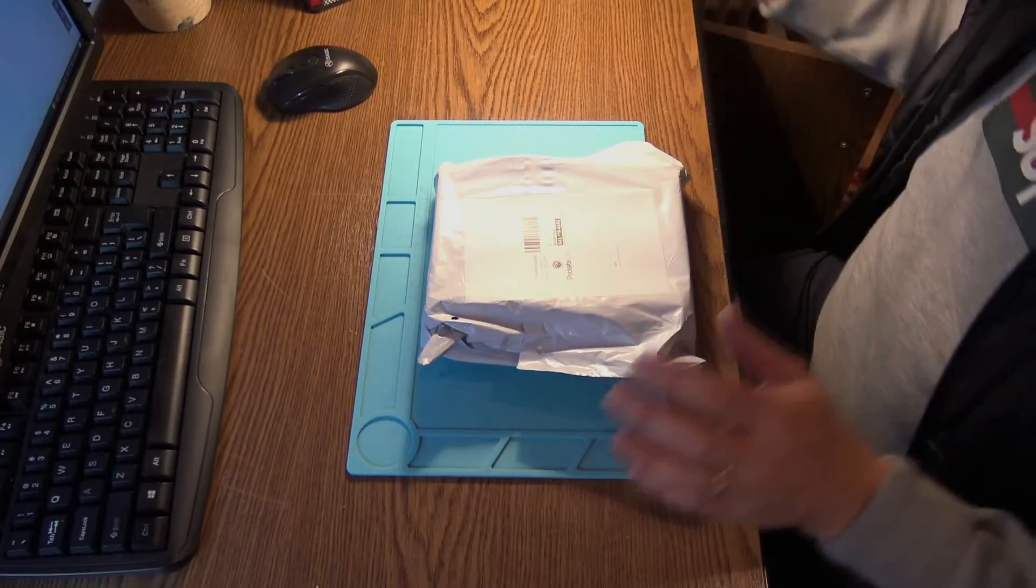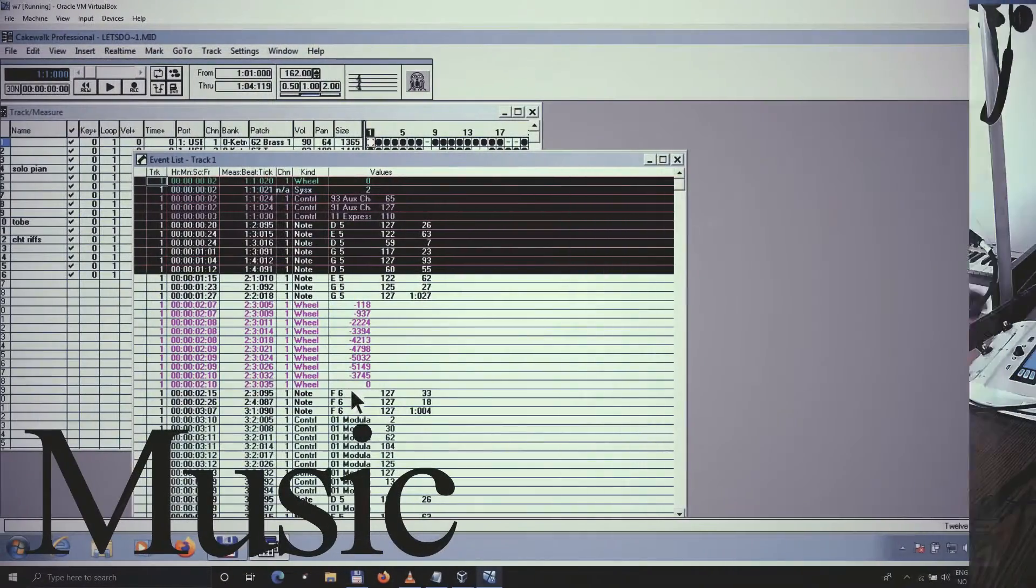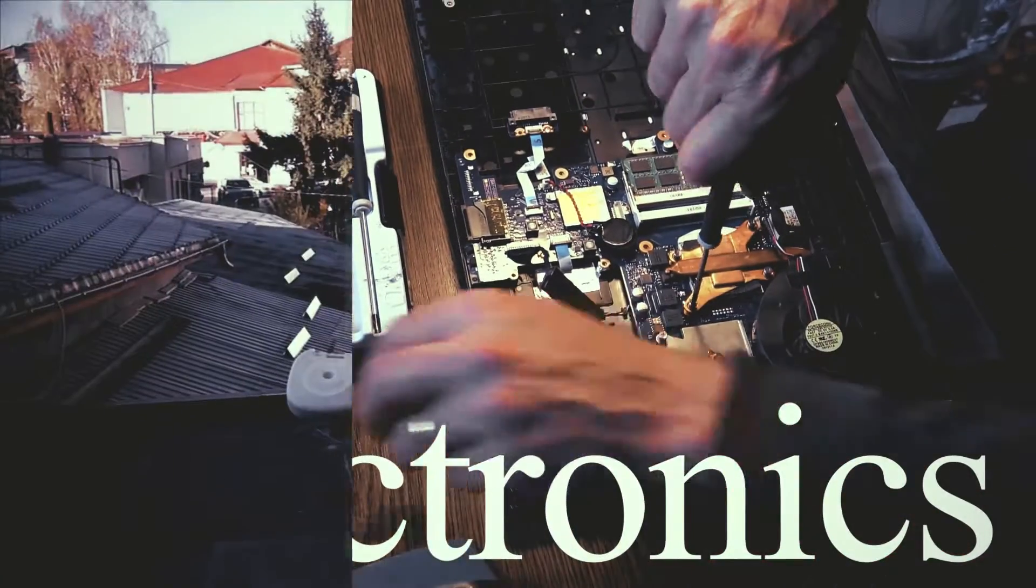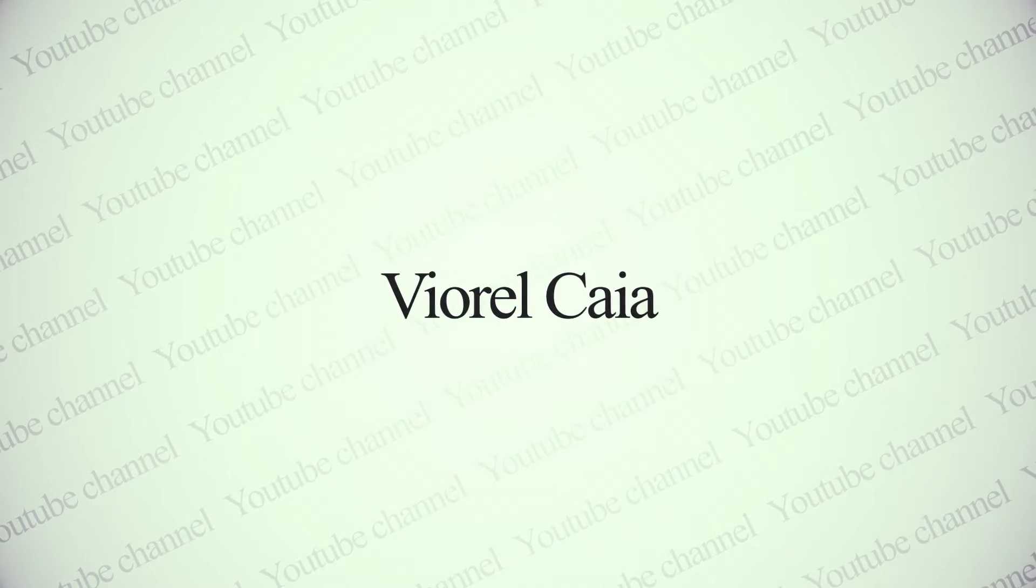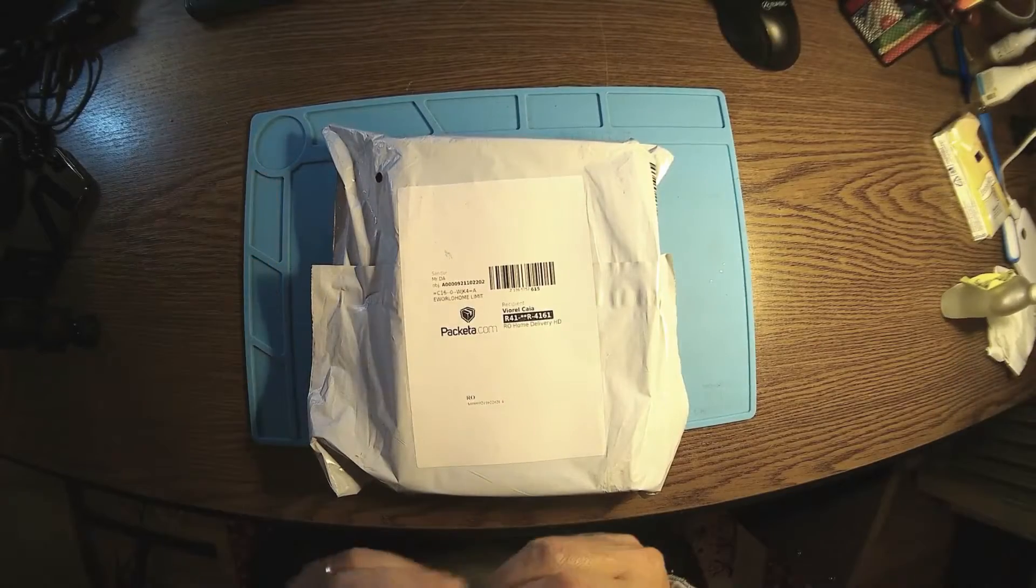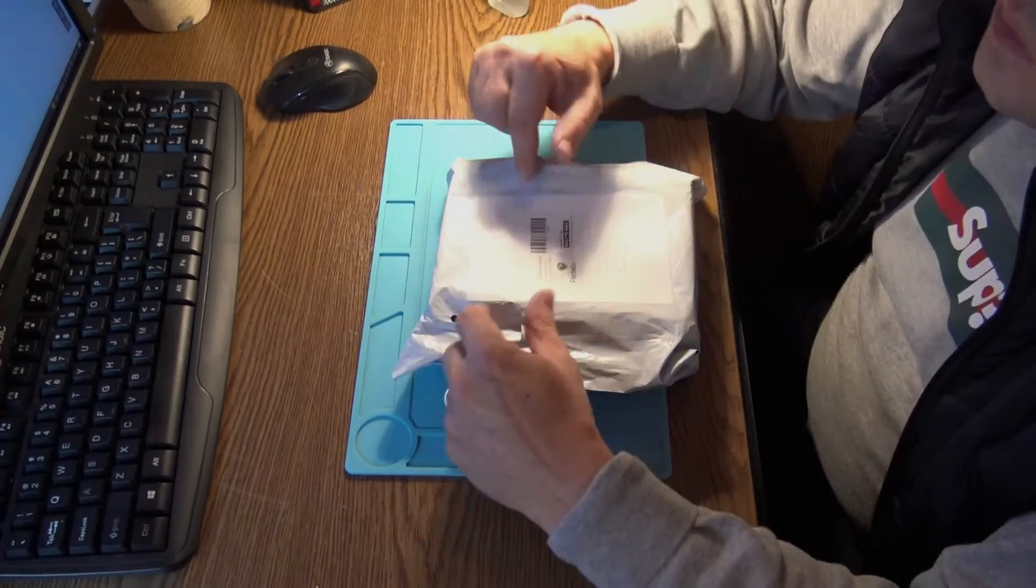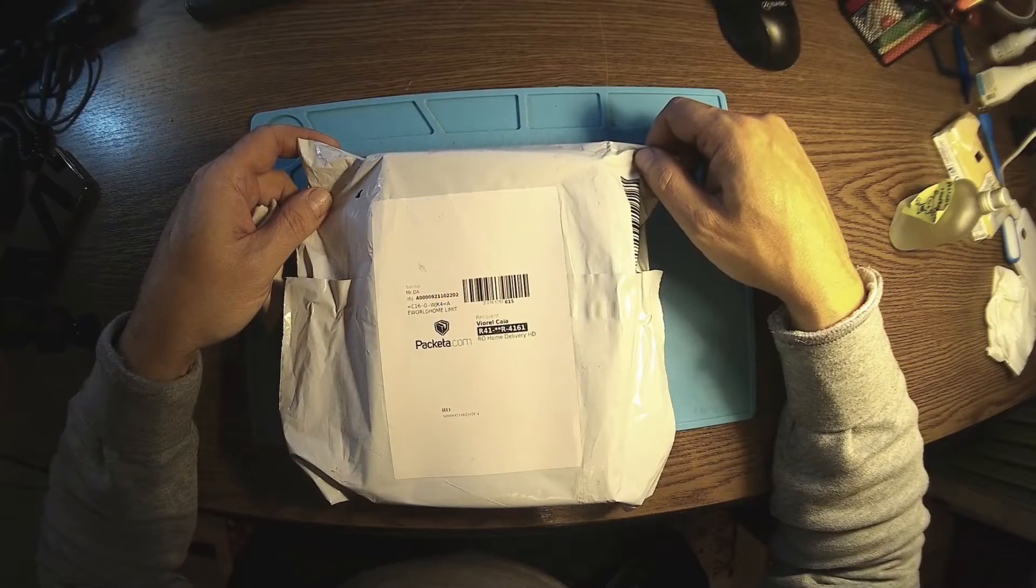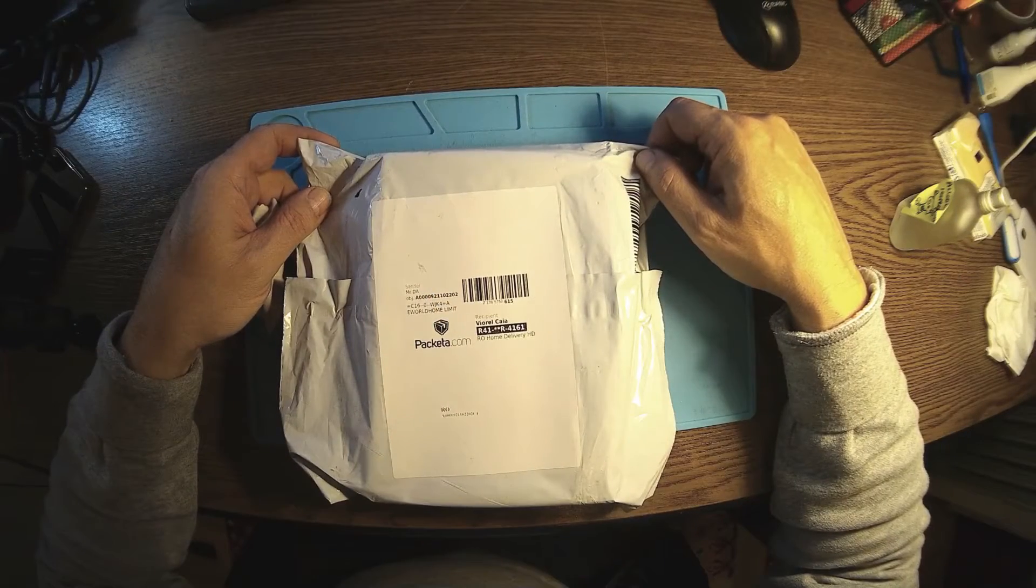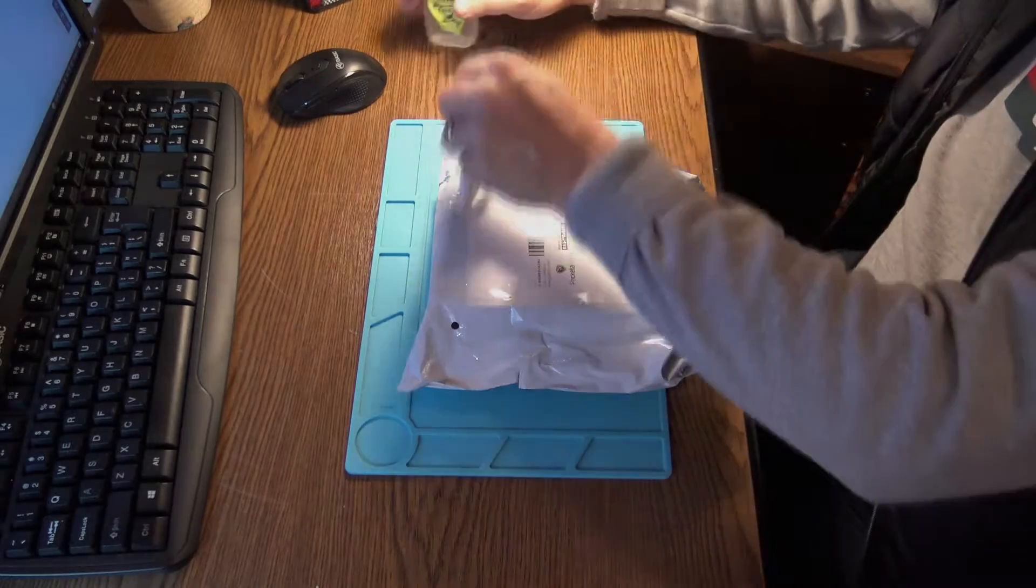A new day, a new project, and here I am again testing a microscope. I told you a while ago that I was going to order some new ones. This one was ordered on the 21st of October and it's the 26th today. Five days with a little bit of care, so it took five days to deliver. That's amazingly fast.